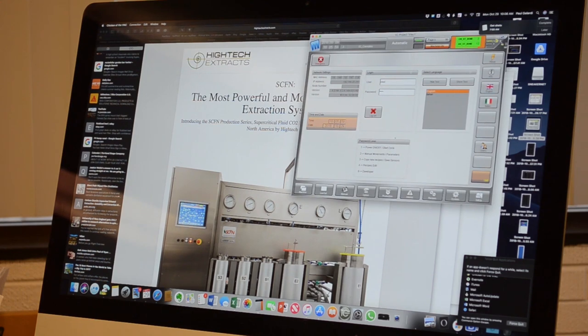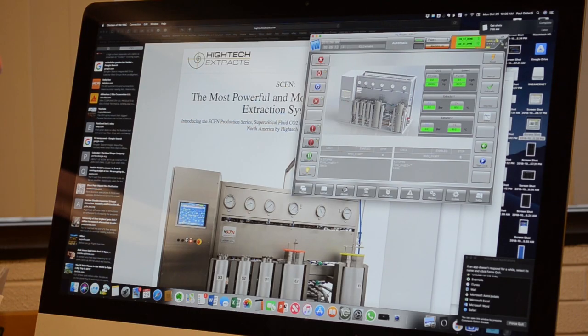We have material loaded in the system. The system is on and just in wait mode. And I can come and open up a VPN connection to the system. The system is already ready to go. So I'm just going to press start cycle button. I just started the system from my desktop.